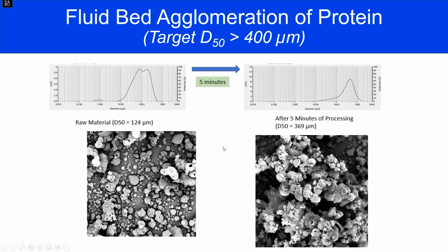But if you look over here after we agglomerated and we're actually able to get some of this structure out of here, you can see that this is absolutely a classic grape cluster. What you're looking for to have that wettability, low density, it's got everything for it. In fact, it's such a low density, it filled up the dryer or the agglomeration system, and we really couldn't process it in a commercial sense.